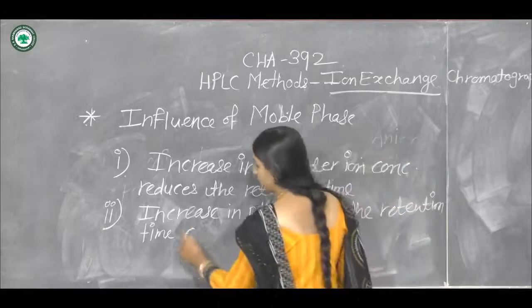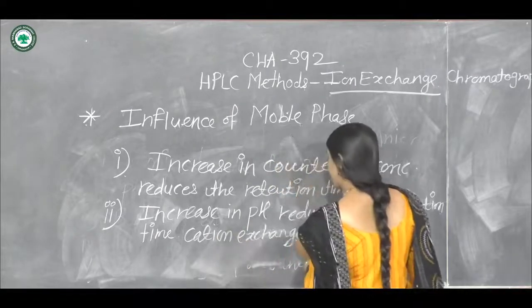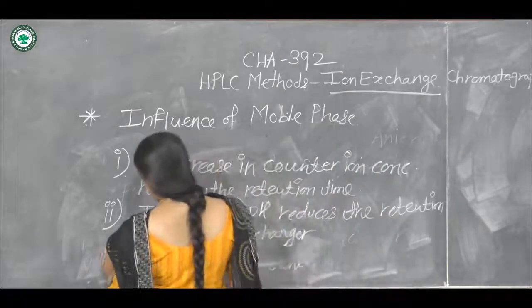This is possible in the case of a cation exchanger. And a decrease in the pH reduces the retention time in the case of an anion exchanger.